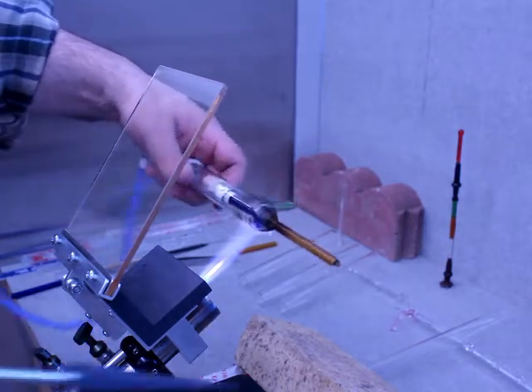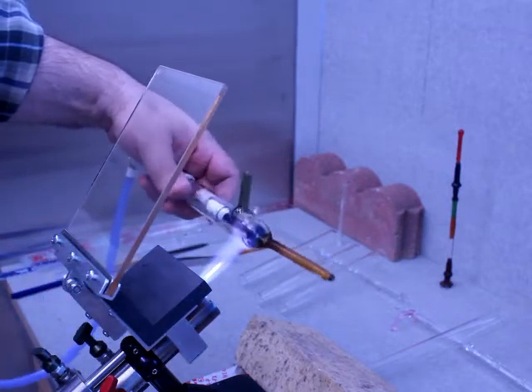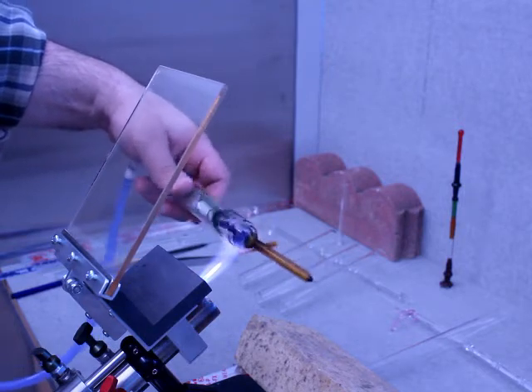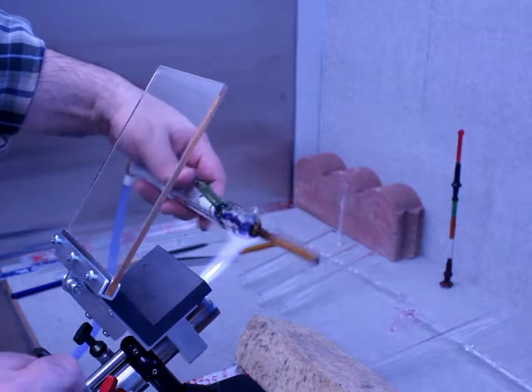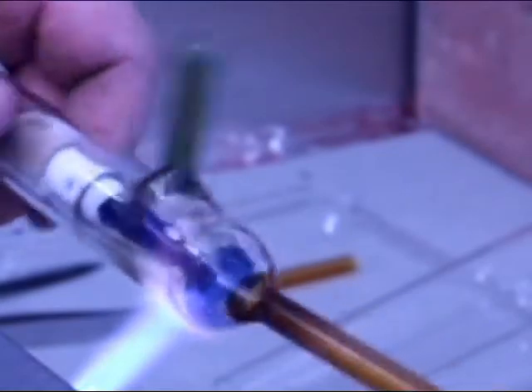So now what I'm doing is I'm focusing the flame right at that interface between the blue glass, which is on the inside, and the colorless 24mm tubing, which is on the outside. And now what I'm going to do, now that I've warmed it up a little bit, is try and sharpen the flame to minimize heating up the side seal or the butt seal.